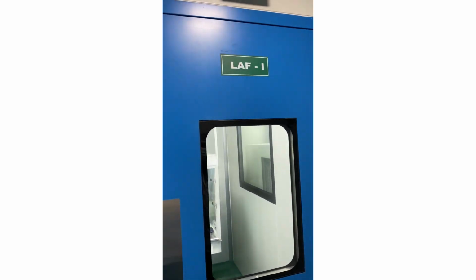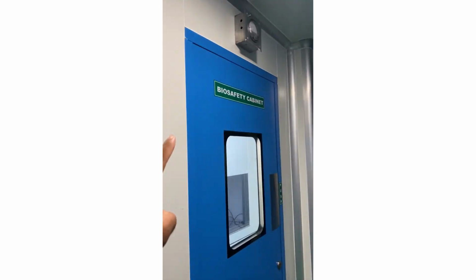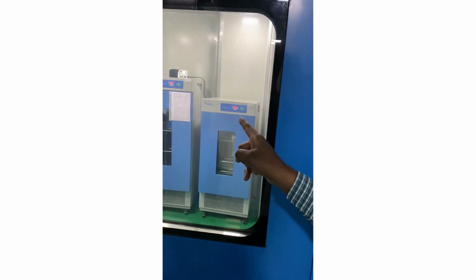Laminar airflow chamber 1, 2. Laminar airflow chamber 2. Biosafety cabinet. Incubation room. In that room we have a deep freezer, an incubator for bacteria, and separate incubators for yeast and mold.